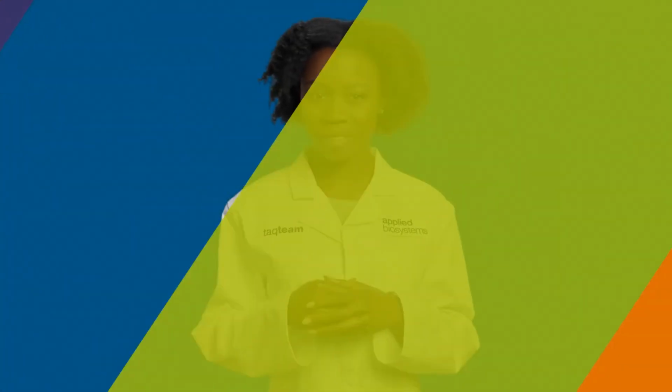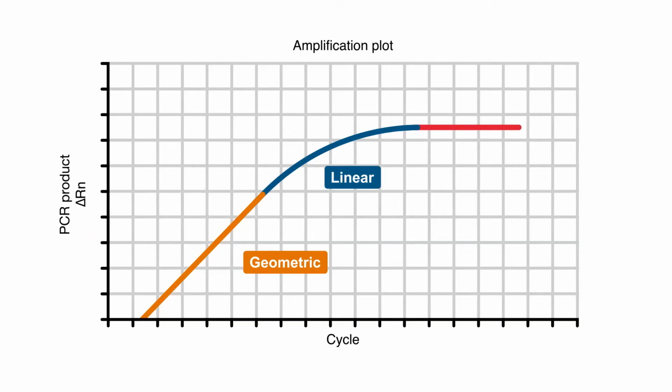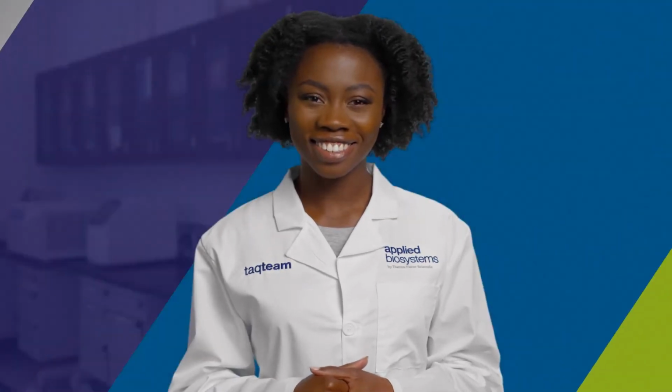Finally, after some point, assuming the plate is run for enough cycles, the reactions run out of some critical ingredient. As a result, they come to a halt. We call this the plateau phase. As I already mentioned, we really only care about the high-quality quantitative data generated during the geometric phase of the reaction. Now, to see why, let's take a look at an example file.